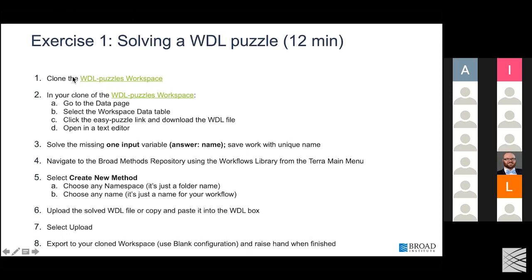So are you thinking about the workflow that we're solving right now, or just in general? Just in general, sorry for the confusion. Yeah, you can definitely change the name of a file name as input to a workflow. Can you think from the examples that you've seen today, can you describe based on that what you're asking? I just want to make sure we're answering your question.